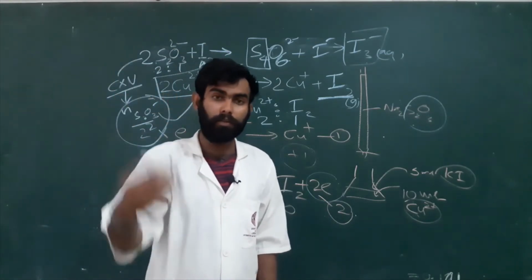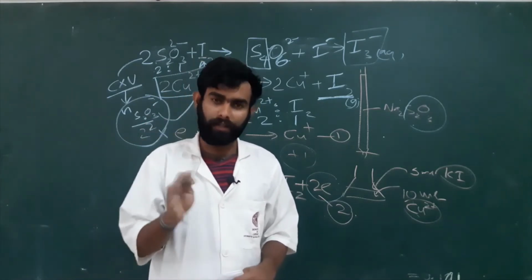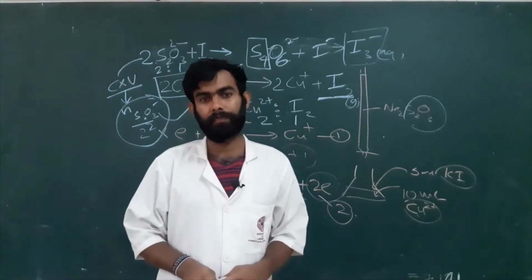Now let's go to our experimental area. We will do the titration. Carefully look at what I am doing and carefully look at the color changes. Let's go.